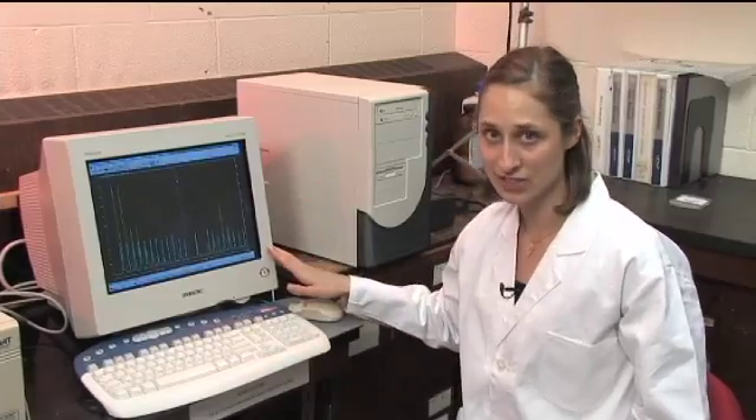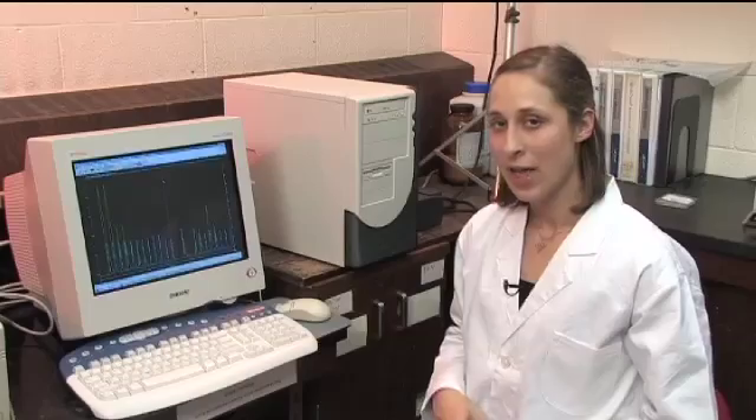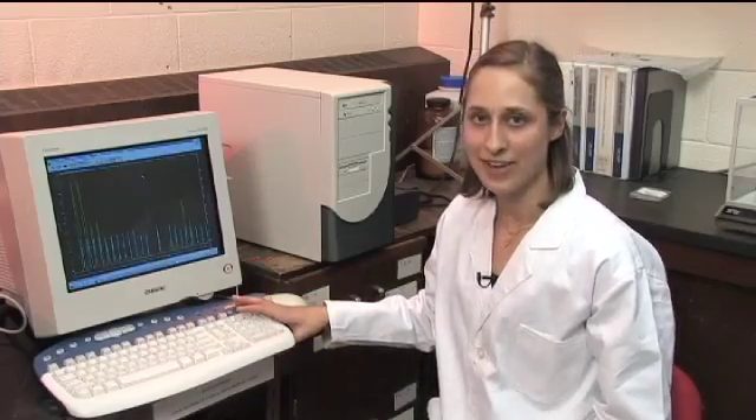Using flow injection analysis is one way to measure phosphate in samples or other analytes such as ammonia. You can also do it manually with a spectrophotometer and do all that wet chemistry on your own, but the FIA is a great way to do it. It saves you reagents, it can save you time, and reduce error because a lot of that is automated for you. So that concludes our talk about the FIA.